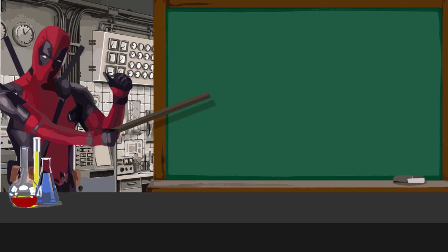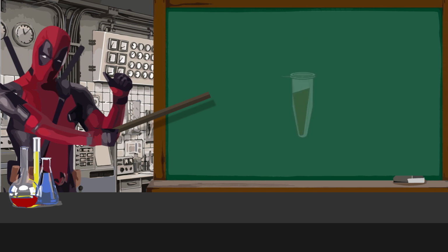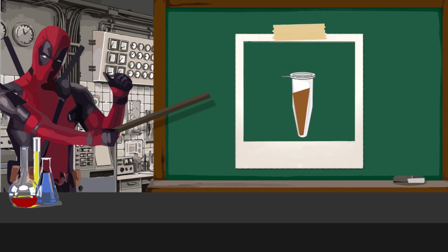To start the process, use the LB plates that were already prepared and contain the transformed bacteria, and inoculate a prepared test tube with 3 milliliters of LB and ampicillin broth. Once you do so, transfer the test tube to a shaking incubator set at 37 degrees Celsius to stay overnight. You then take a picture of what it looks like before you incubate it, and then of the aftermath of overnight incubating.